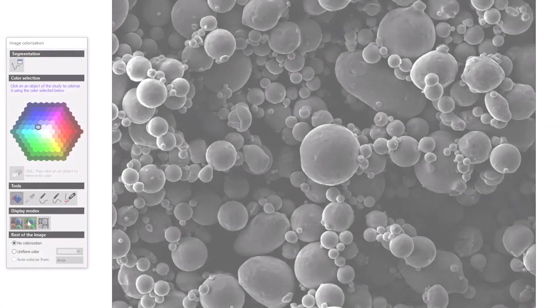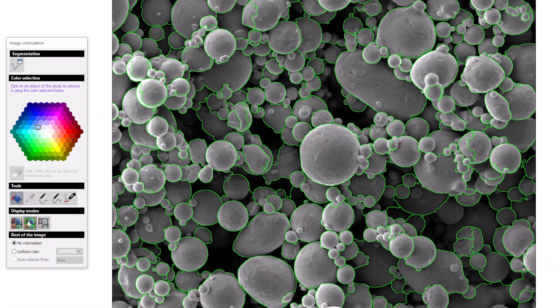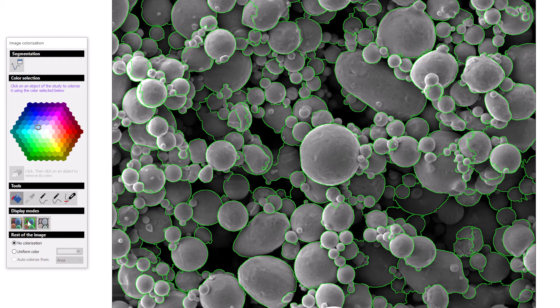Of course, if you are not happy with the object recognition performed automatically by Mountains, you can change it manually.